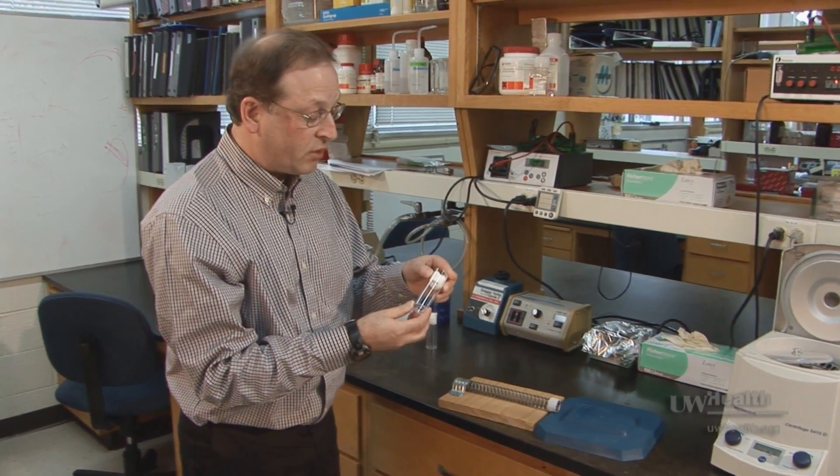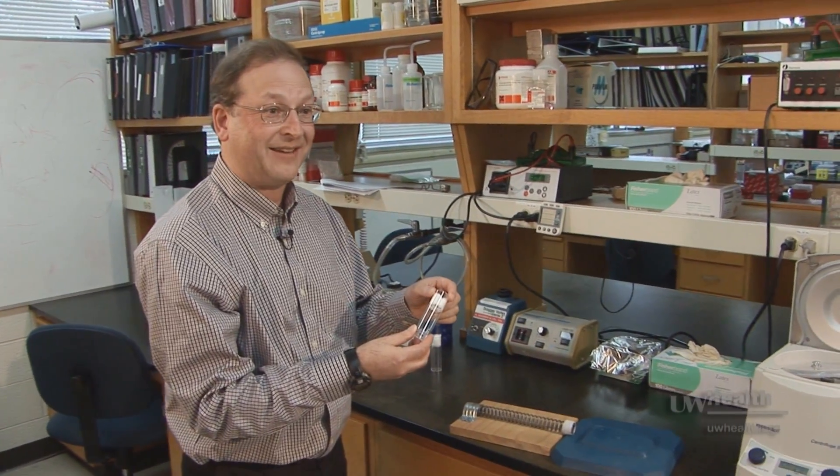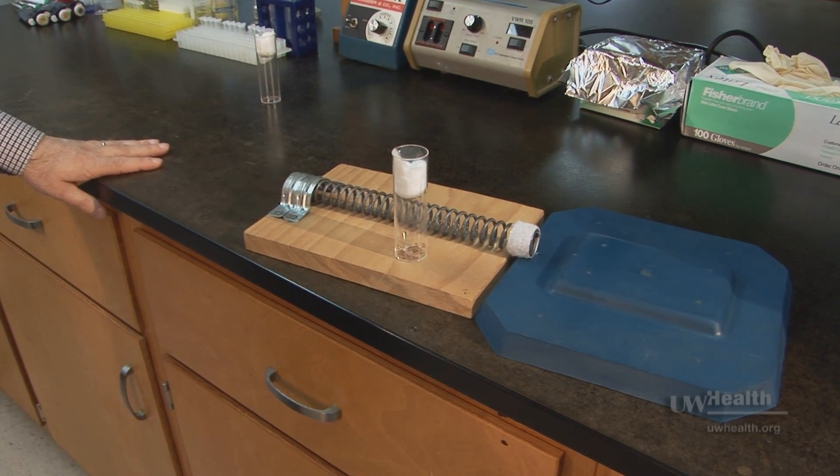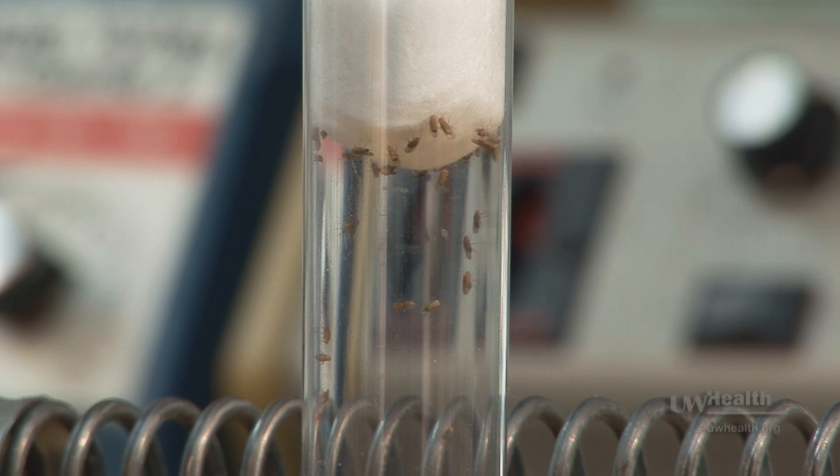What we wanted to do is reproduce that motion. We can now use this apparatus to inflict injury in a very reproducible way.